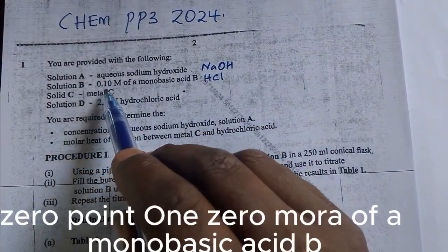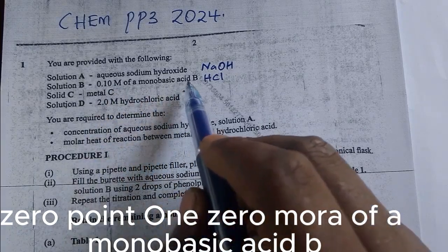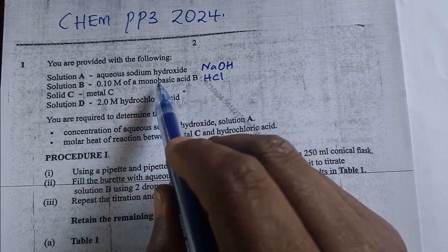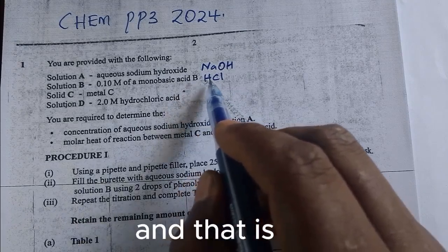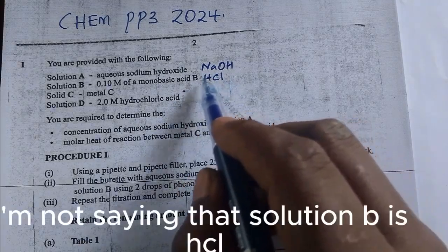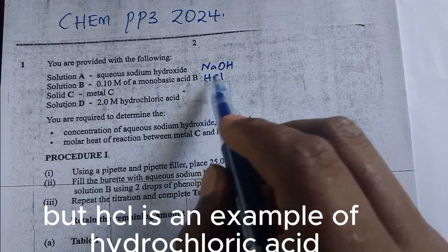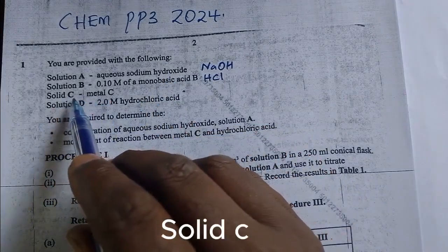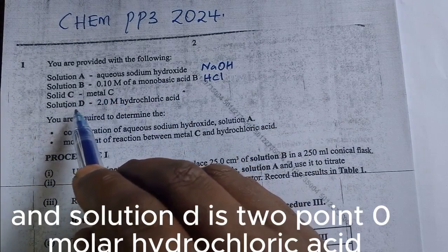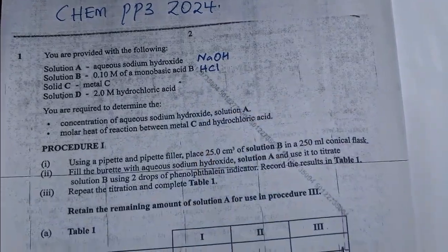Solution B, 0.10 molar of a monobasic acid, B. So monobasic is an acid which contains only one hydrogen in it, and an example is HCl. I'm not saying that solution B is HCl, but HCl is an example of a monobasic acid. Solution C, solid C, metal C. Solution D is 2.0 molar hydrochloric acid.